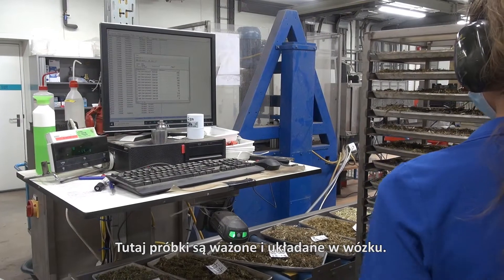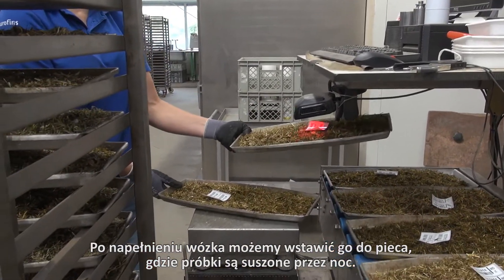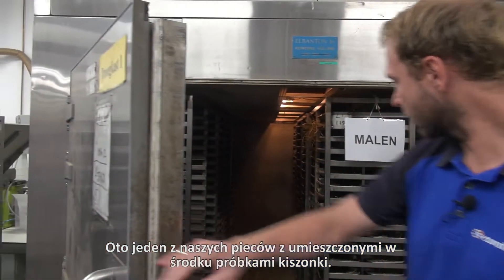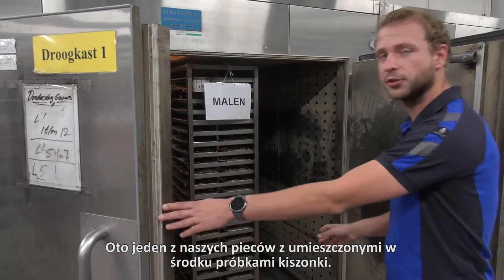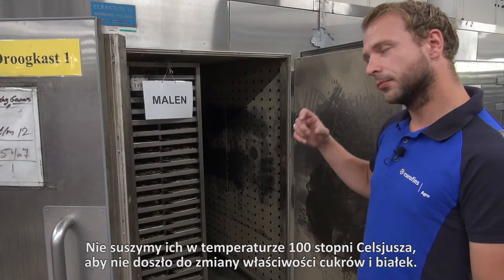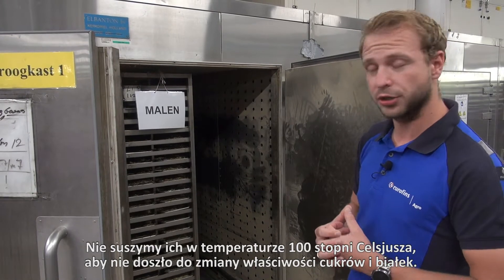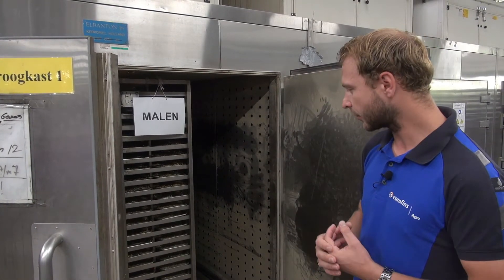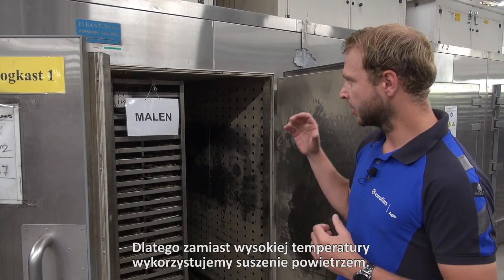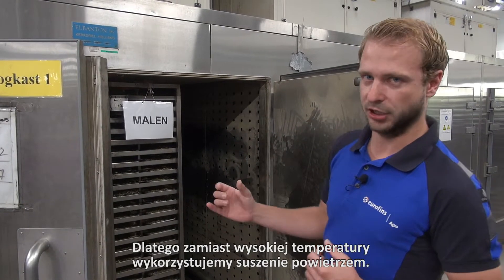Here the samples are being weighed and put in the trolley. Once the trolley is filled we can put them in the oven where they will be dried overnight. One of our ovens where all the silage samples are in — they stay here overnight. We do not dry them to 100 degrees, because otherwise your sugars and your proteins will start evolving. They will have different shapes, so that will interfere with the results. That's why we dry them air dry, as we say.